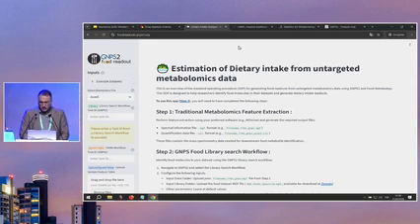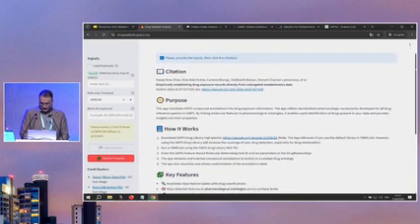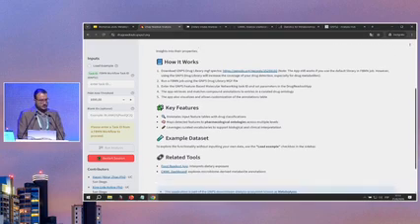Okay, so Professor Ricardo asked me about what to see on the actual library. So what's in the spectral database? If you go directly to the web page of the information, and then you go down to how it works, it's basically going to show a more summarized version of what I just presented now.